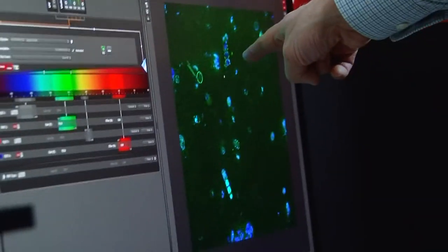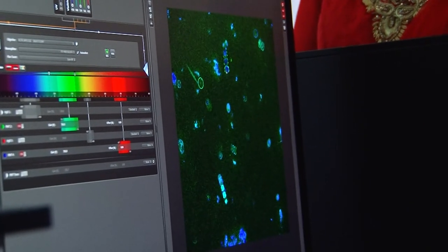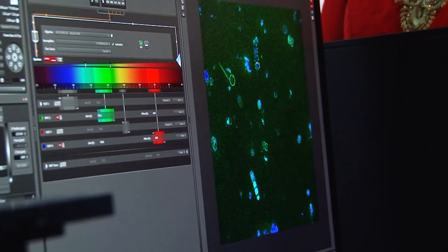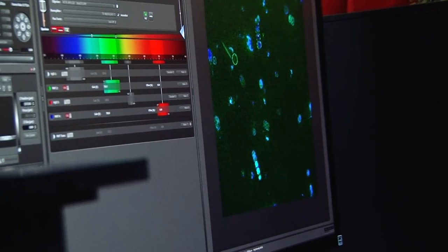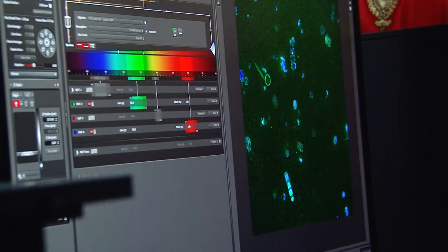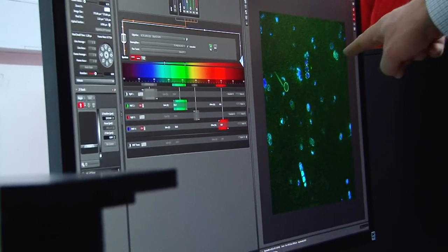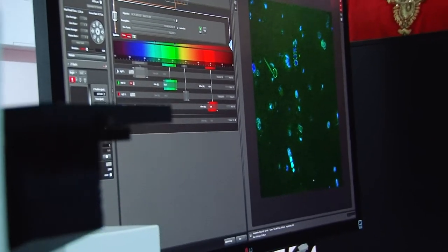Okay, let's try to get this one in the middle. See if we get this one in the middle. Or closer to the middle. Right, that's good. You're moving it down. Focus. Okay, that's pretty good. So, what you want to do is go counterclockwise a little bit. Keep watching it. And we want to watch where this starts to get blurry. Okay, so we're going to pick the bottom of our Z stack.